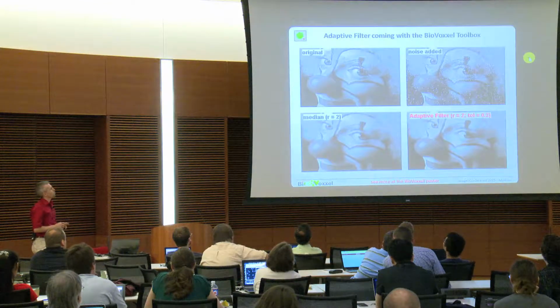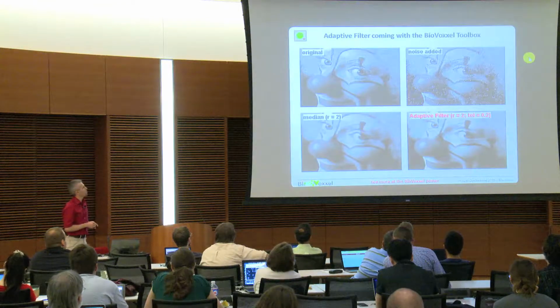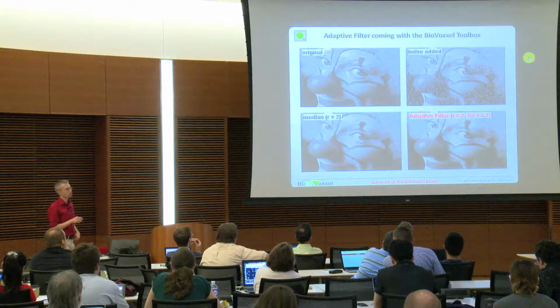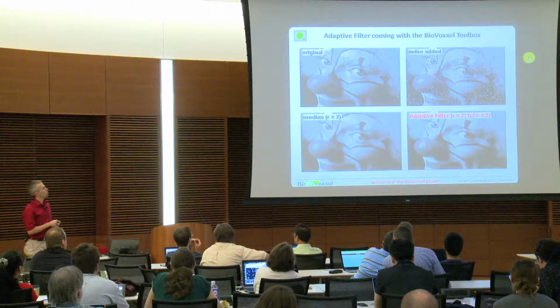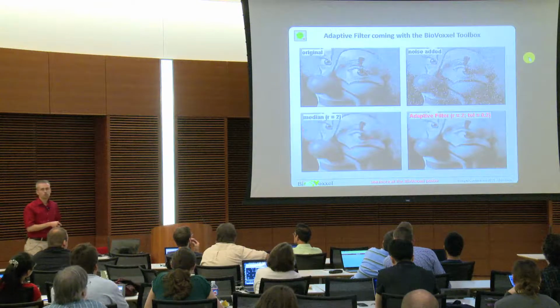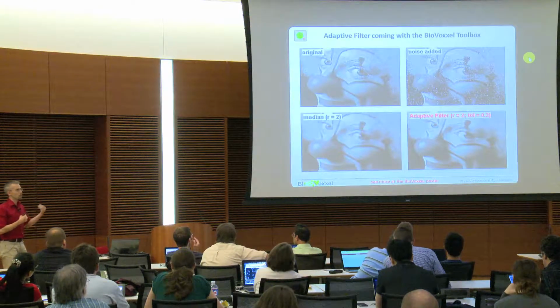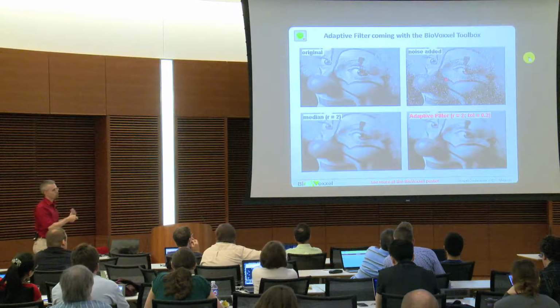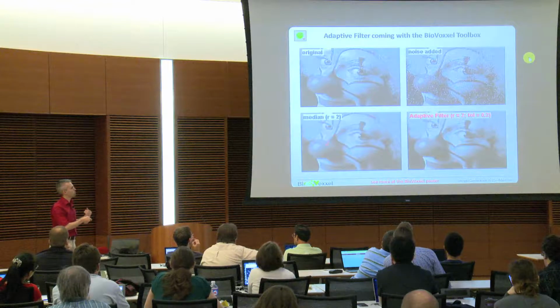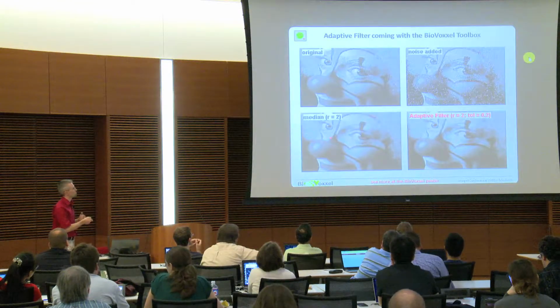There is a second filter which you also can try basically by yourself if you add noise to an image, which is the so-called adaptive filter. The adaptive filter, you see that when you have noise in an image, the median filter, because of the principle Ari explained, that it actually eliminates outliers. The noise is an outlier normally in a homogeneous environment, and if you apply a median filter, you get rid of the noise, of spot noise, especially efficient.